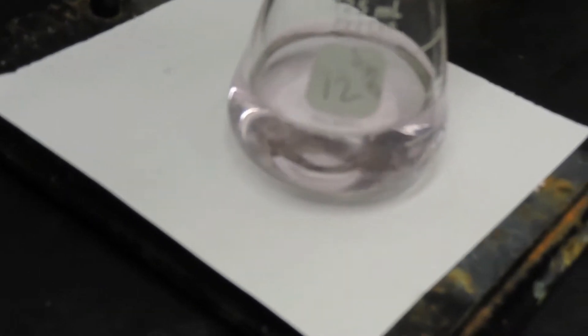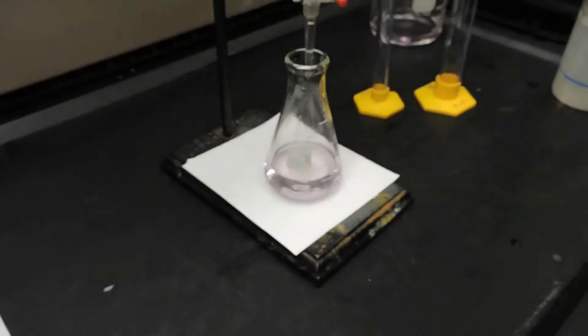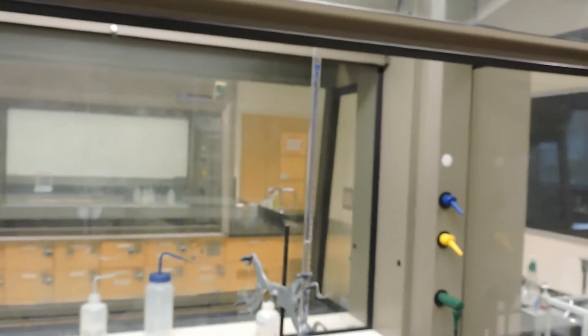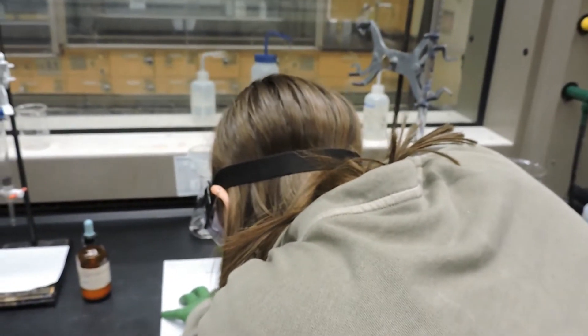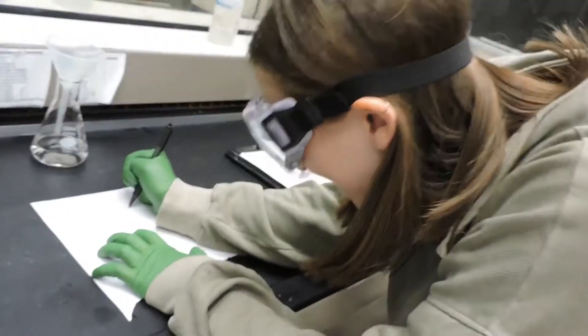The solution is now a very light pink and is almost perfectly titrated. The final volume of the burette with the standardized sodium hydroxide solution is 25.01 milliliters.